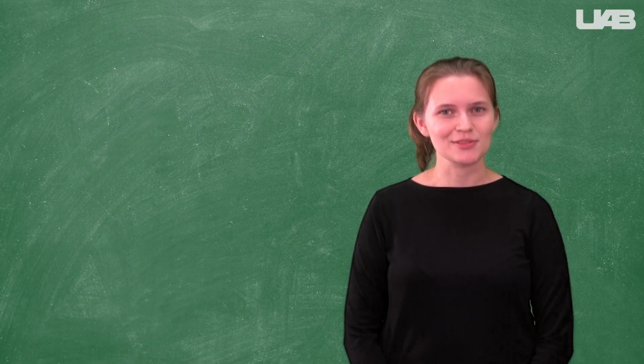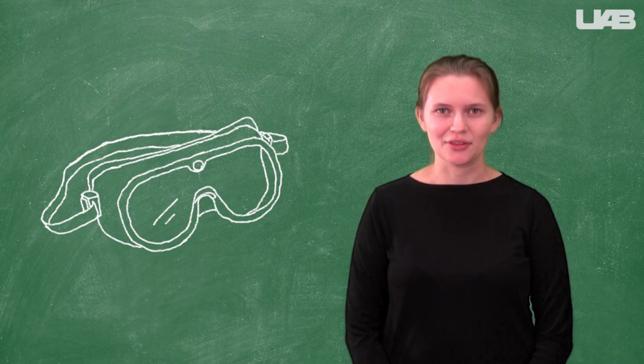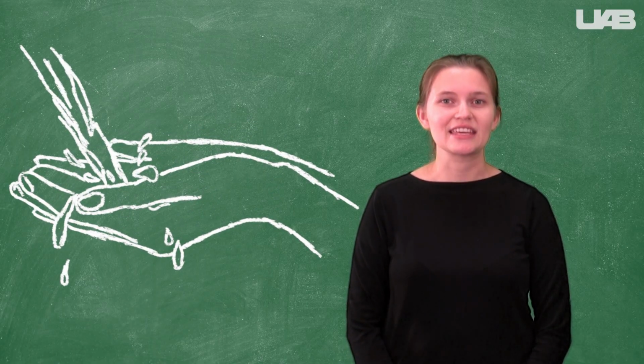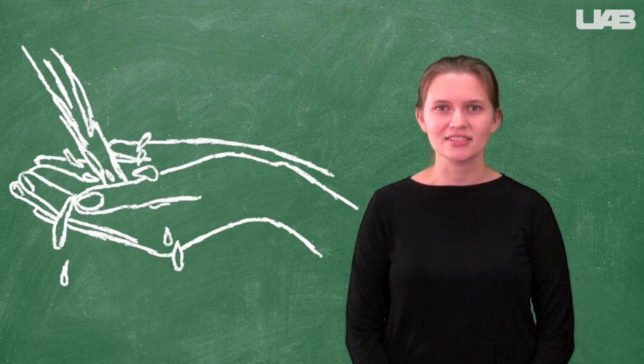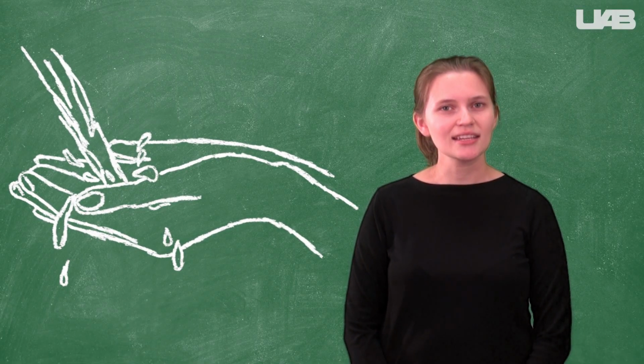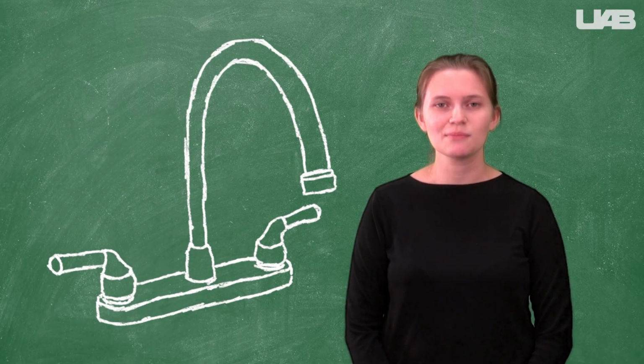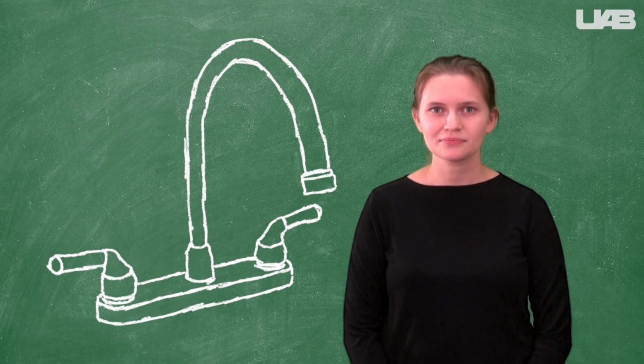Let's talk safety and disposal really quickly. You must wear your goggles whenever chemicals are out in the lab. If small volumes of the acid or base solutions come in contact with your skin, you can flush the area with water. Let your TA know if there's a large spill. All of the solutions used today can be poured down the sink with water.